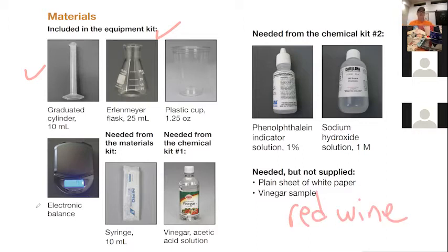Why won't red wine vinegar work well? White wine vinegar will be fine. Red wine vinegar, not so much. How come? The color. Yeah, it's the color. Basically, it's already the color we needed to turn. So that's not going to really work so great.